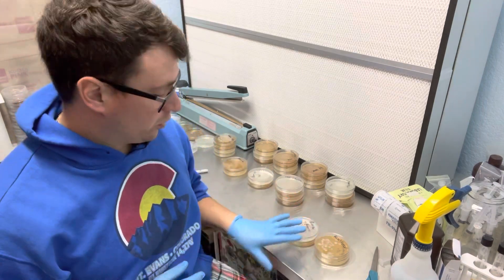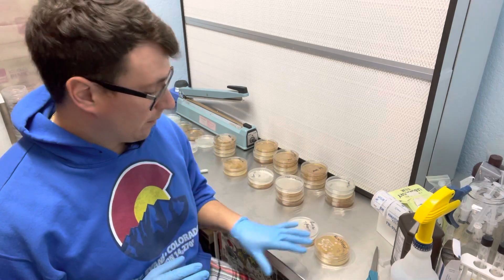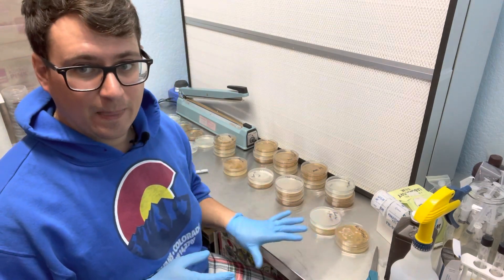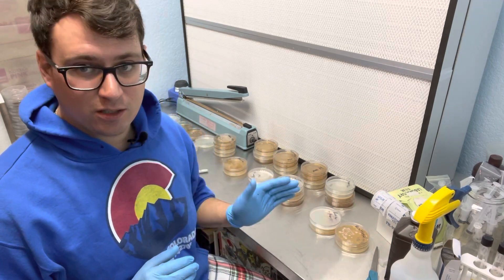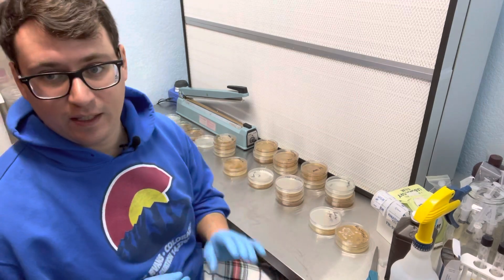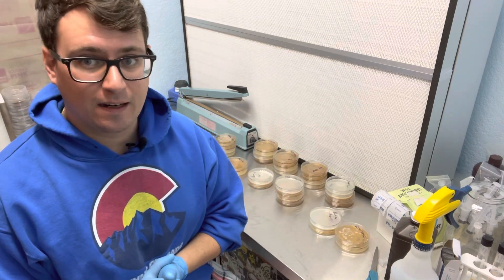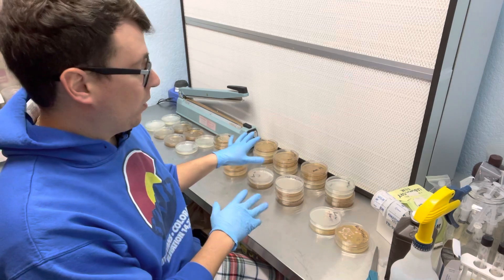I'm building a separate video just for this because I think it's a really cool process. It's not something that I do often, or at all actually until now, so I wanted to walk through adding different peroxide to try and save any plates that might be contaminated. But first things first, we'll break down the difference between the tween 20 plates and the plates that were not tween 20, and then I'll show you the difference between a diluted spore sample compared to the 20 mil spore solutions. If you haven't seen it yet, the immaculate inoculation video — I'll post the link again — but moving forward you should have watched that video which goes through the process on how to get to this point when you're breeding mushrooms.